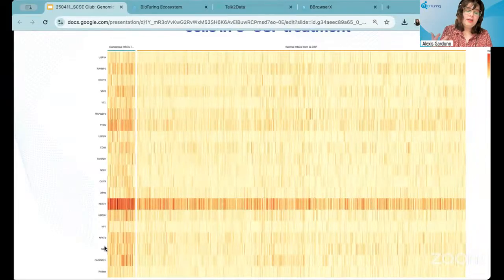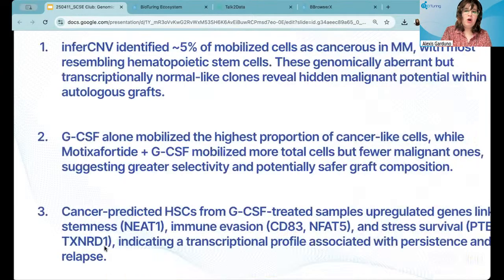So there's a lot of analysis and a lot of insights that you can gather once we run the infer model, and you can use these prediction results to run other downstream analysis from there, specifically if you have different treatment models that you want to analyze further.